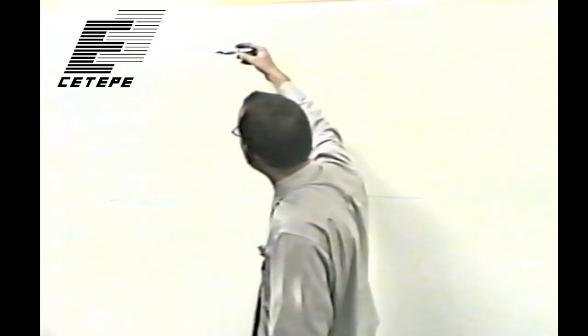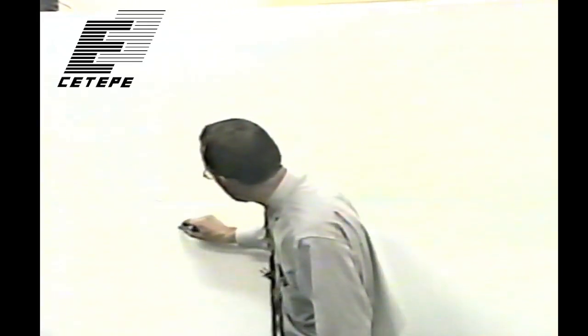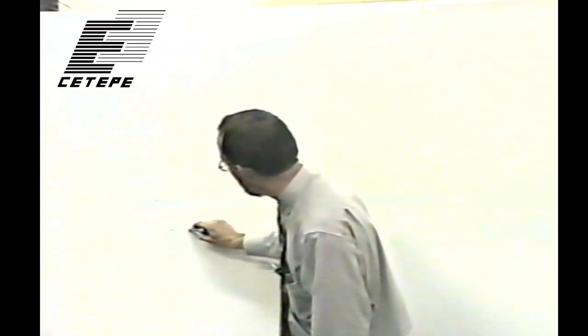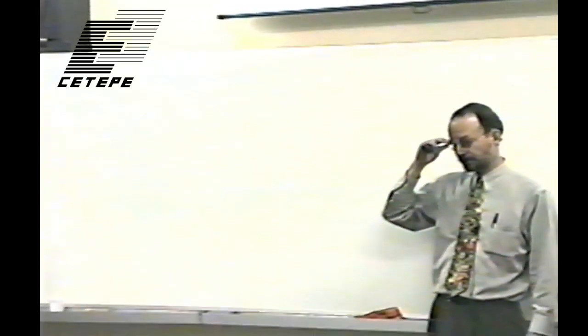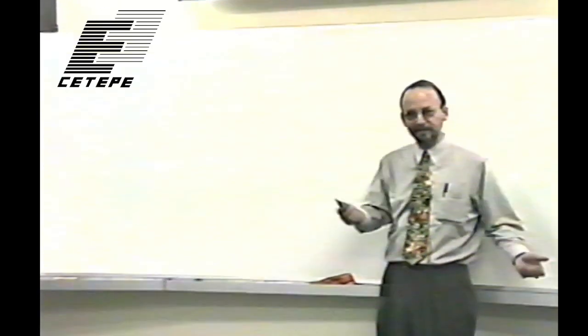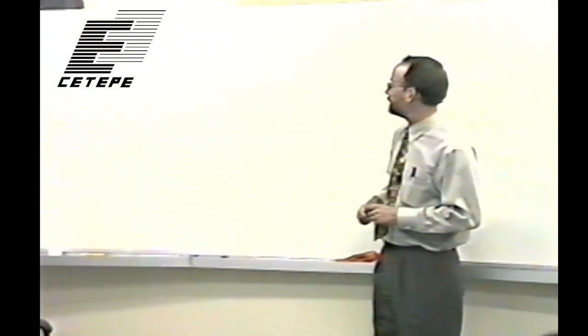event. Okay, so this would be the way I drew it for most of the atoms that we're interested in. This would be the L binding energy. So this here would be equal to the binding energy of the L shell. And this energy here would be equal to the binding energy of the K shell for whatever atom. Okay, so these binding energies are a function of Z number, but you can look them up in the CRC, the Handbook of Chemistry and Physics, or any number of sources will tabulate these binding energies.